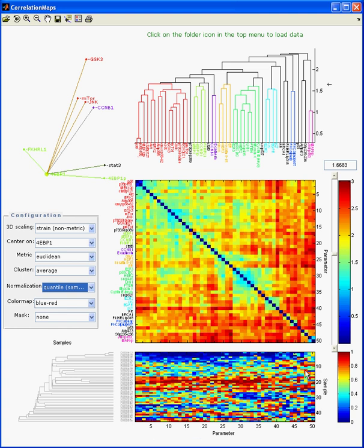Now I'm going to jump to the very top. On the very top, you have the same cluster analysis performed but now on the parameters. A default cut-off point is selected to color the different branches of the dendrogram. There is some theory behind this which I can explain later if you want.